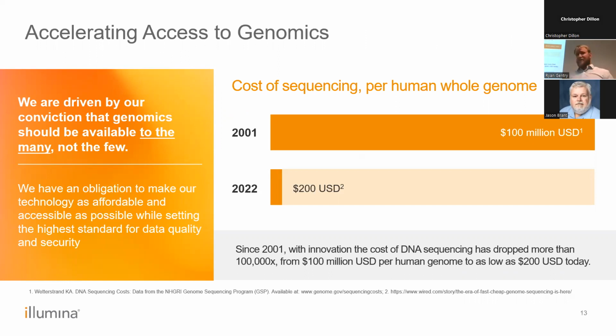And so you have a great sequencing core here that has some of the state-of-the-art instrumentation that gets the sequencing down about as low as you can get at this moment. As you can see here from 2001 versus 2022, you can do about a 30x whole genome at about $200 nowadays, going into 2023.